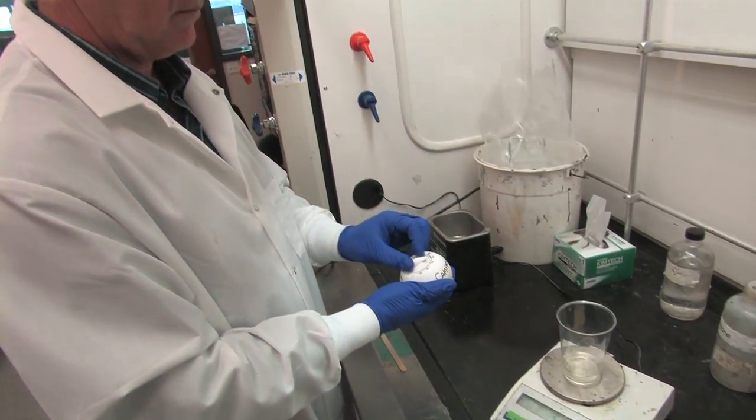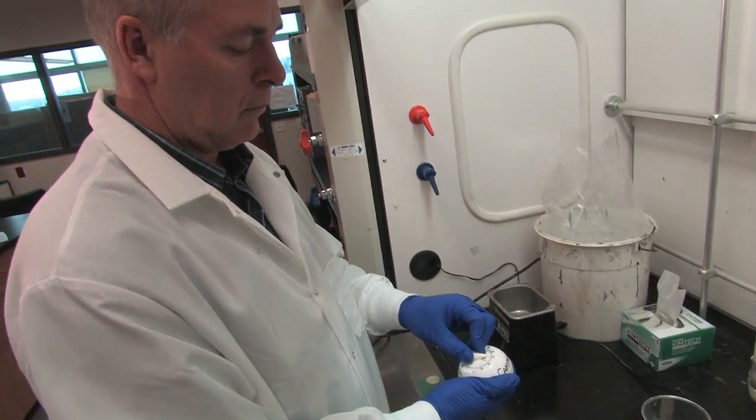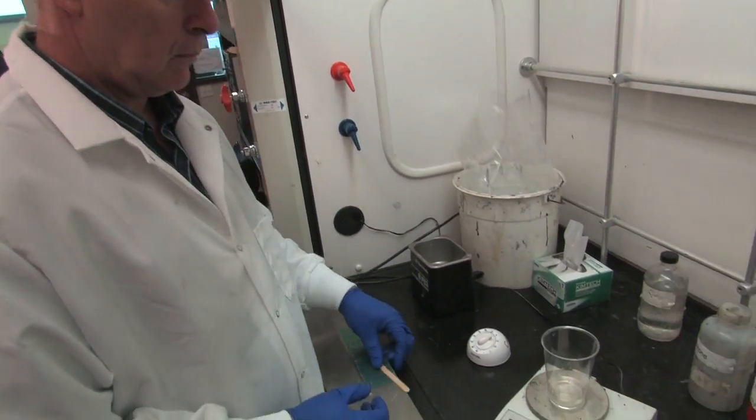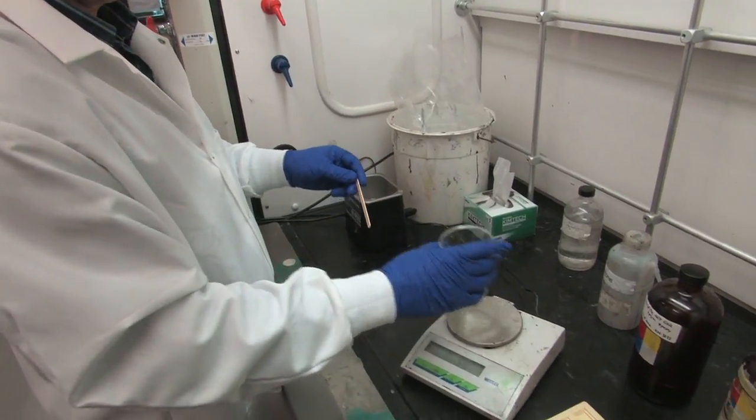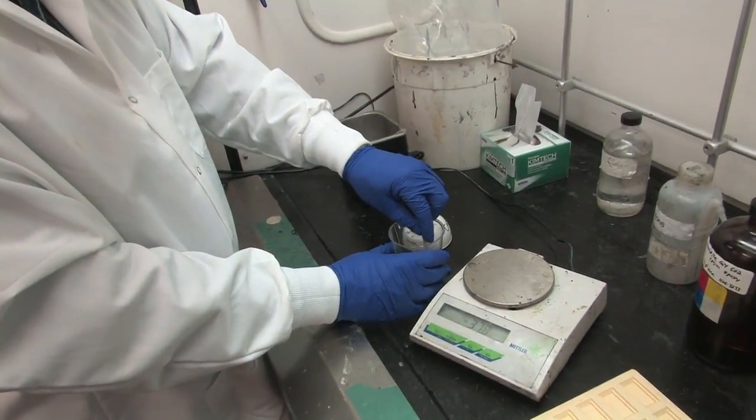Once the hardener and the epoxy are mixed, use the timer and stir the mixture at a steady pace with a wooden stick for about three to four minutes.